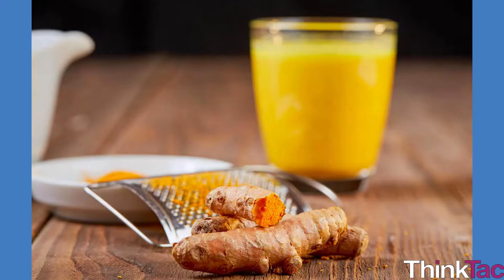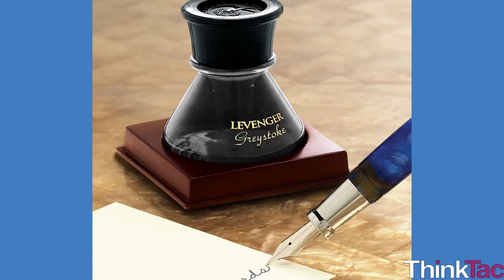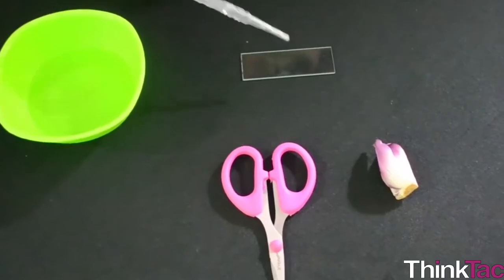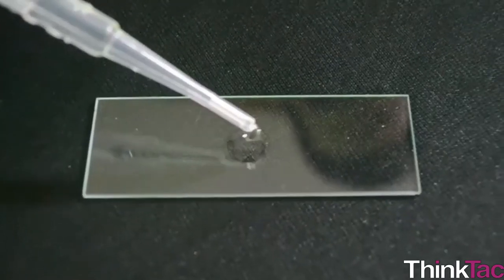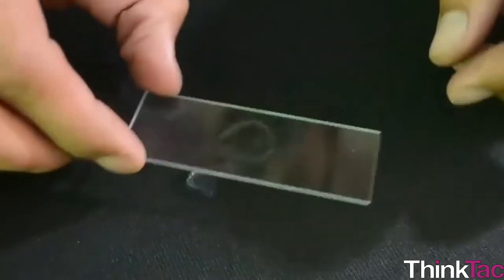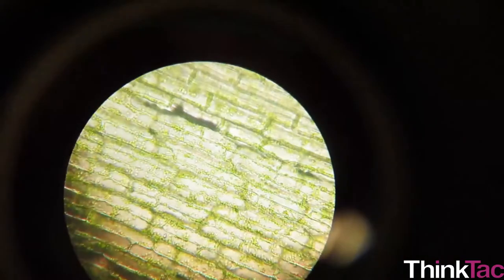Why do you think this is happening? If you don't have saffronin, what else can you use? How about turmeric solution, pen ink, or iodine solution? To understand the relevance of water, repeat this fun activity without adding any water. What is your observation now?